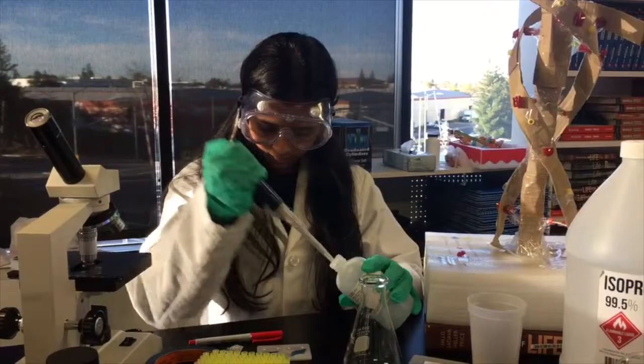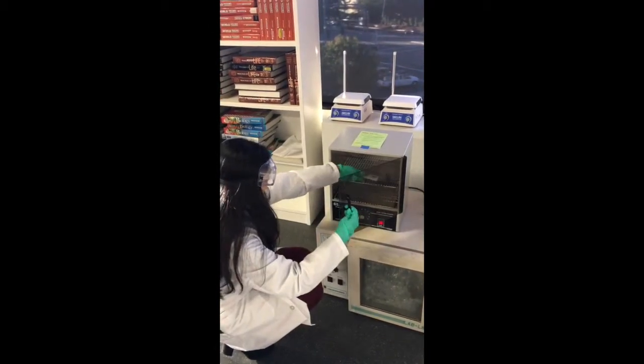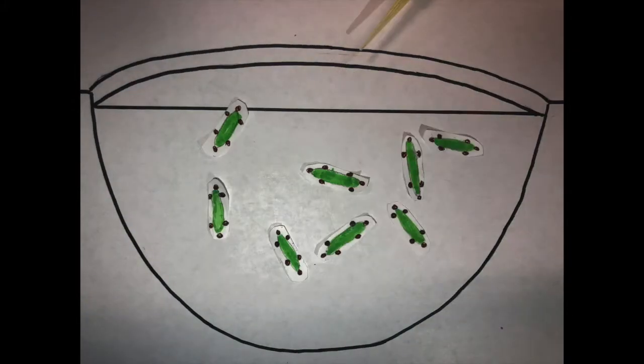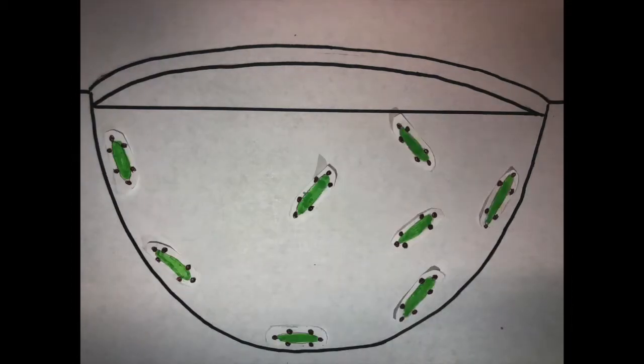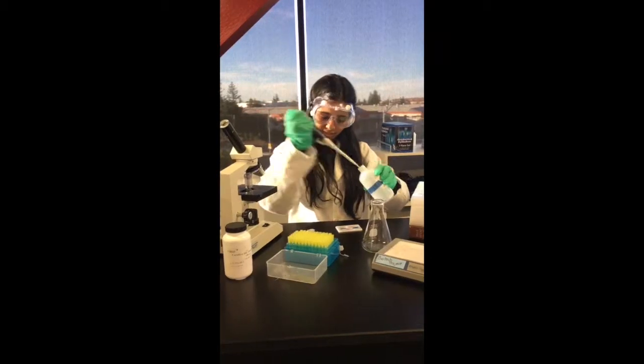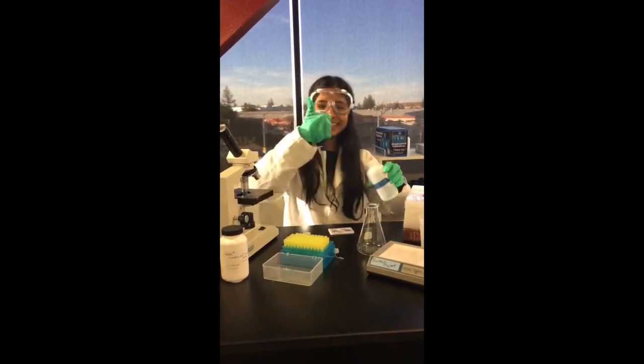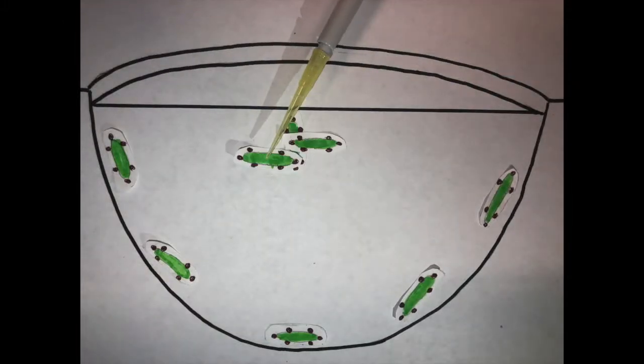I will add the solution to each well and incubate this plate for 5 minutes at room temperature. This will allow for the antigens to adhere to the plastic in the wells. When the incubation is done, I will remove the antigen solution from the wells and wash the wells with PBS buffer, which I will remove as well. This will wash away excess antigens.